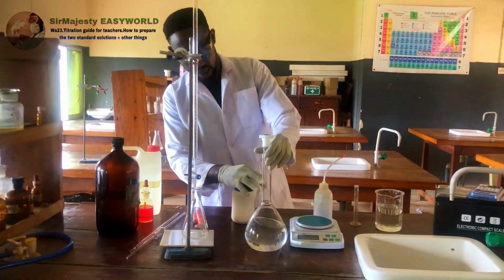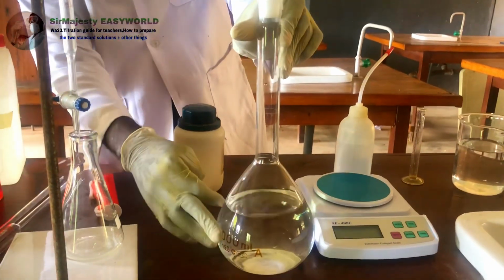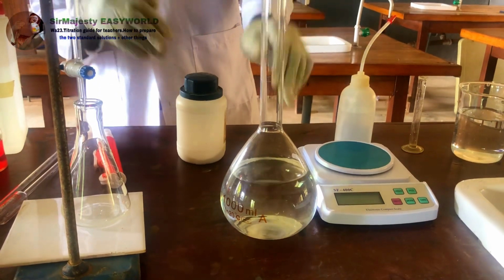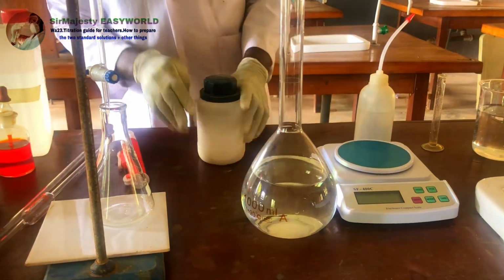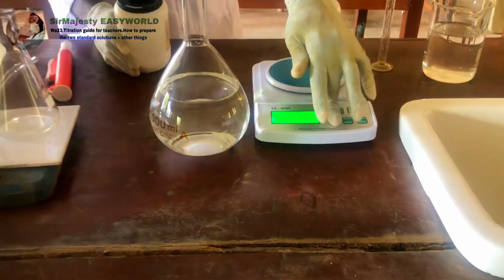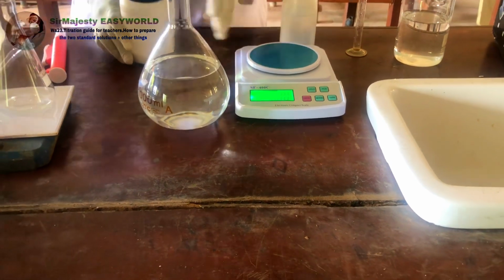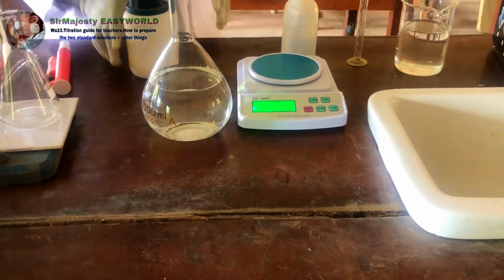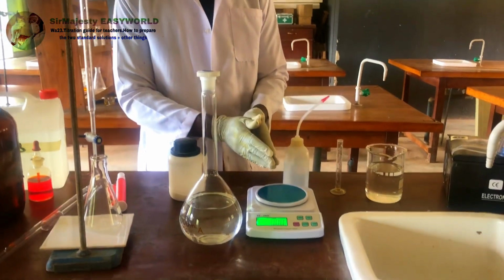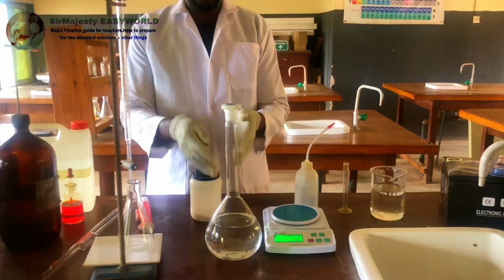This here is 1000 ml. This ring is the 1000. You know I did not fill this. So if you measure, this is the digital balance. If you just press here, see, it's already started, and now everything you place here will be measured well. You place your filter paper and add until you get the mass of the filter paper added to the mass of the salt. When you get the mass, you dissolve here and shake well.